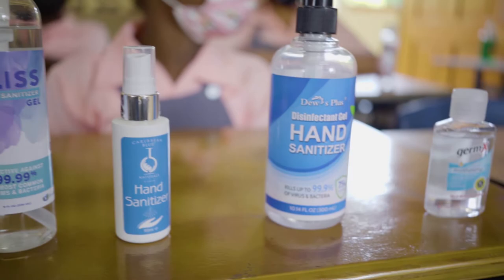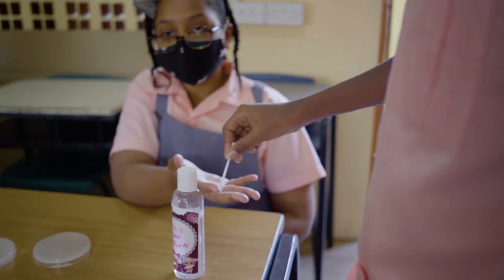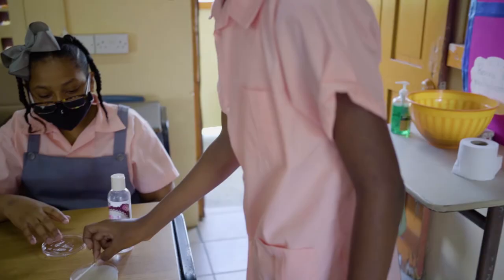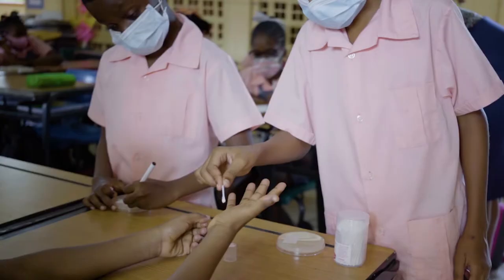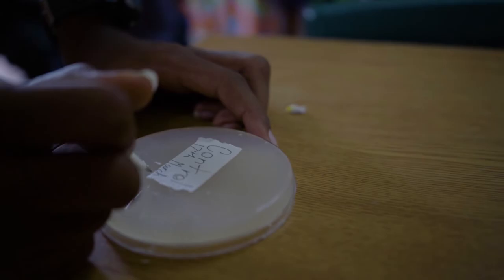Then we swabbed it on a clean plate and labelled it unsanitized with the name of the volunteer and the date. We used nine different brands of sanitizers. We asked the volunteers to use the hand sanitizer as directed by the label and then swabbed their hands with a clean cotton swab. This swab was then used to swab a clean agar plate which was labelled sanitized, name of the volunteer, the hand sanitizer used and the date. We left one plate aside as the control, which means we didn't expose this plate. We left the plates in a corner in our classroom where it wasn't too cold or hot.